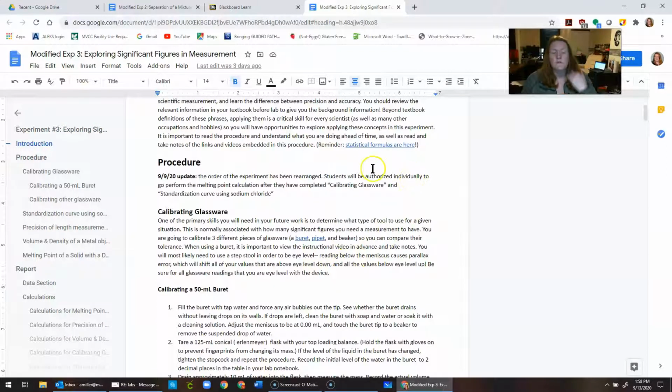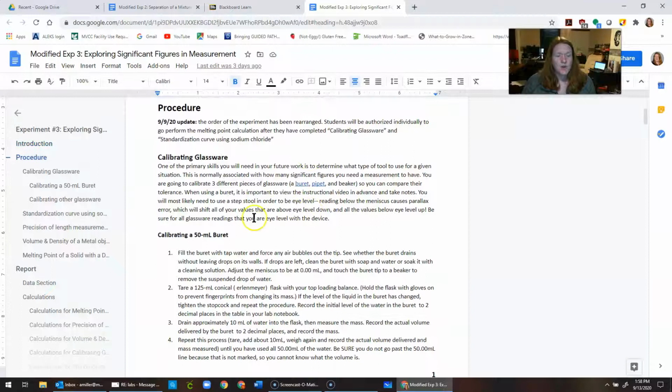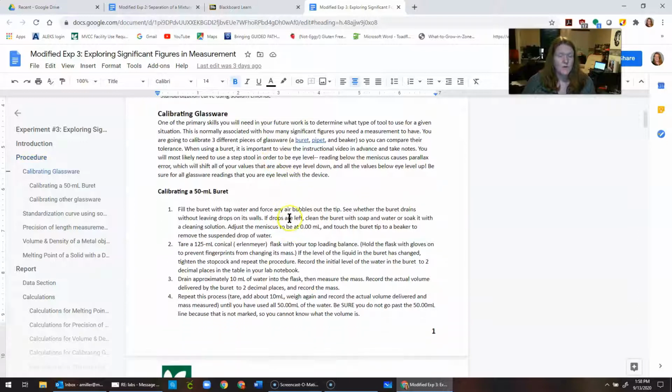All right, and so you're going to start off with calibrating the glassware, and there are 2 different videos linked in here. You want to watch them both and take note of what each glassware is, how you can tell them apart, what sig figs they have, and any helpful tips that you think will help you remember how to use it when you get into the lab. It's probably worth watching these kinds of instructional videos a few times before you come in for lab.